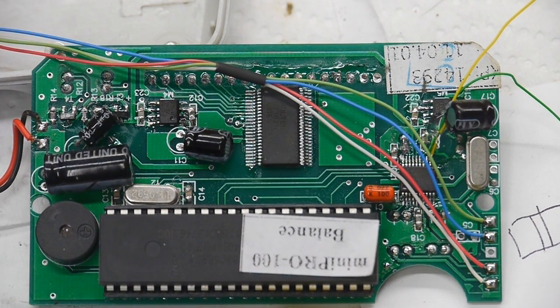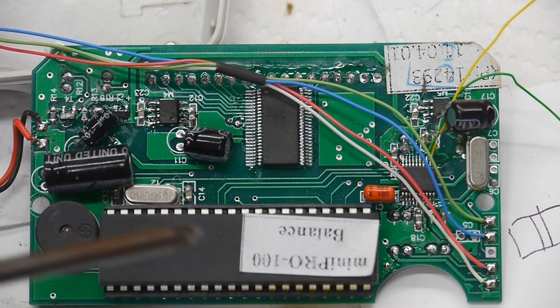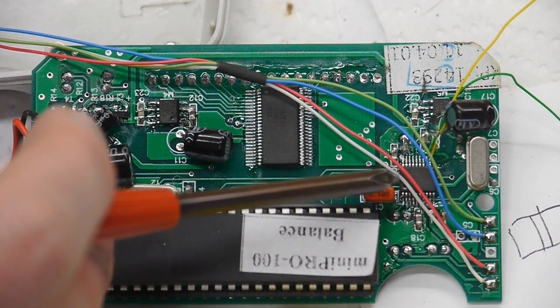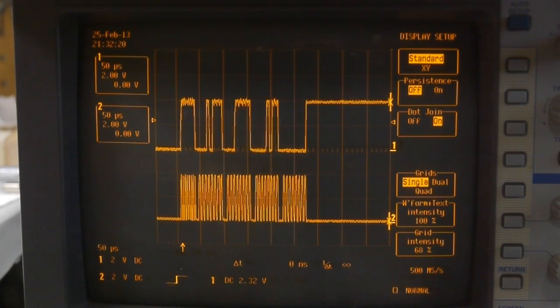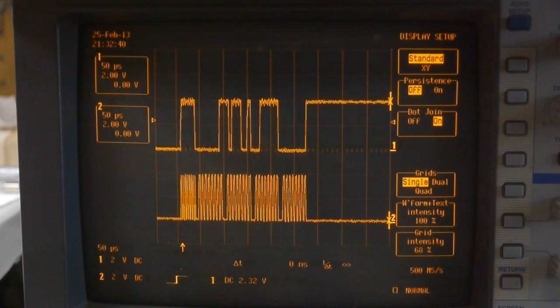This ADC is set up with the reference voltage going into the Wheatstone bridge, so it would be very difficult to tap the analog side. I pulled up the datasheet for this ADC, and it turns out the data line and clock line go directly into the microcontroller - the data is read out in a synchronous way. I tapped the clock and data out from the ADC chip and looked at them on the scope. The bottom trace is the clock line going from the microcontroller to the ADC, and the top trace is the data coming from the ADC. Pressing on the scale causes the higher-order bits to change, which agrees with the datasheet.